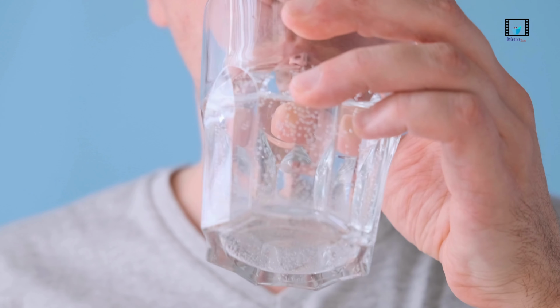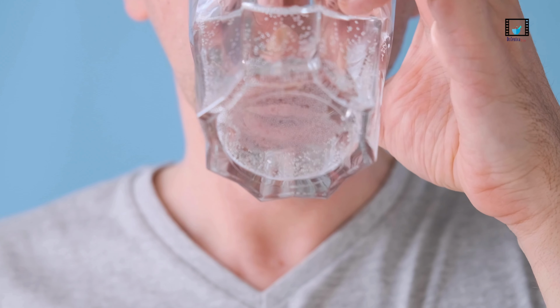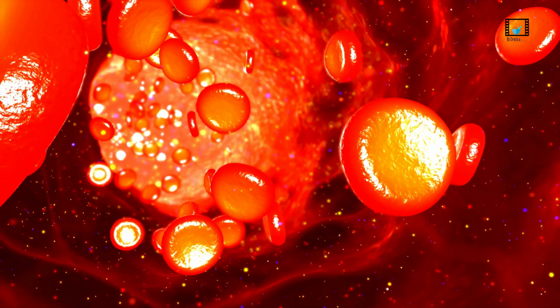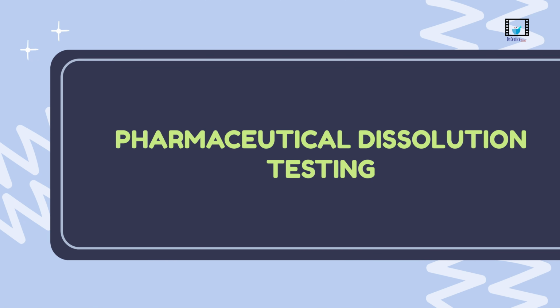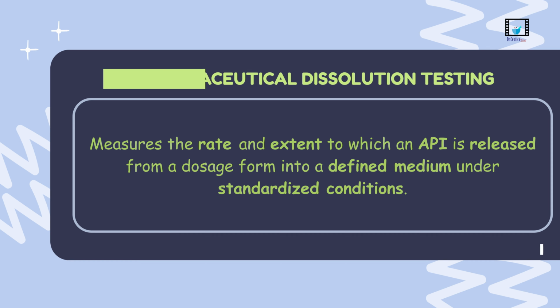Every tablet faces the same first challenge. Before it can heal, it must dissolve. But how do we know it's dissolving the way it should? That's where pharmaceutical dissolution testing comes in.